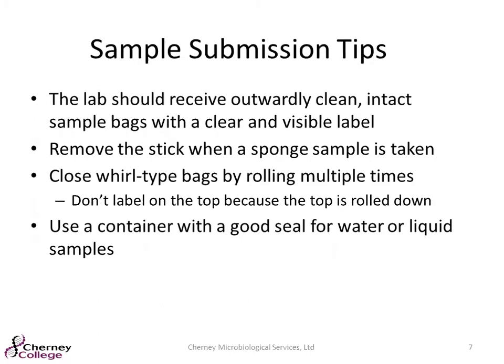So we want to receive an outwardly clean bag or custody cup, no cracks, no holes. If you're taking an environmental, remove that stick prior to it getting sent, because your hand has been on that stick, so that is compromising the inside of that sample. Roll down your Whirlpak bags numerous times to prevent things from oozing out.